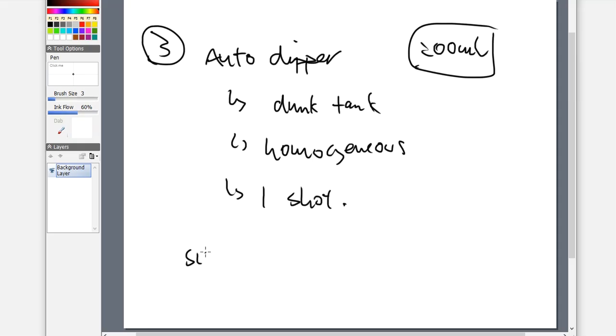The entire surface of the silica, which is the drawback here with the auto dipper, is going to be exposed and it's going to re-wet itself. And when it re-wets itself, what you will very often see is that the silica becomes wet and can slush off of there if you're not very careful.